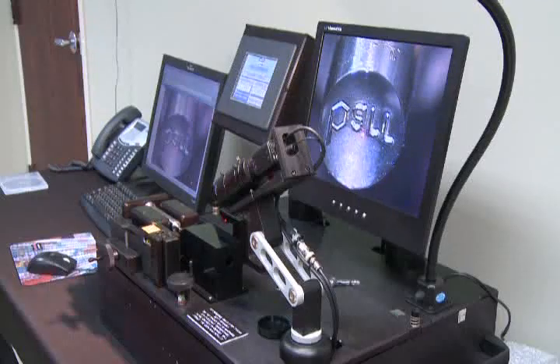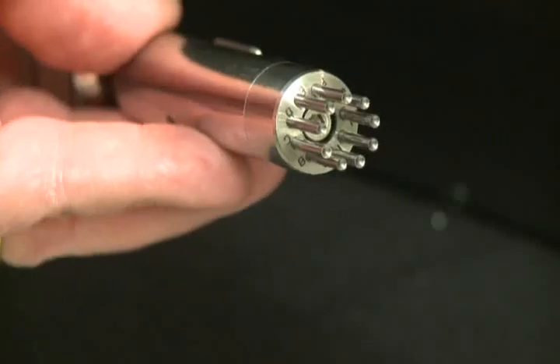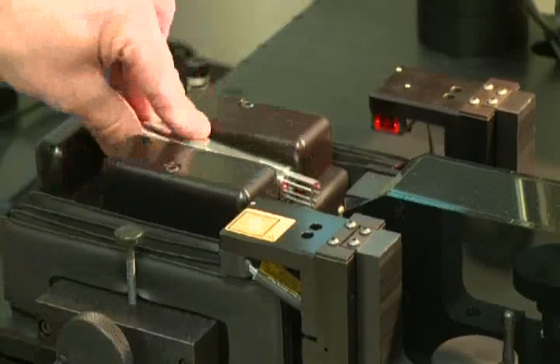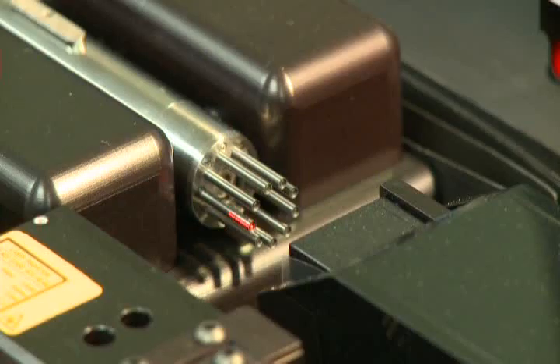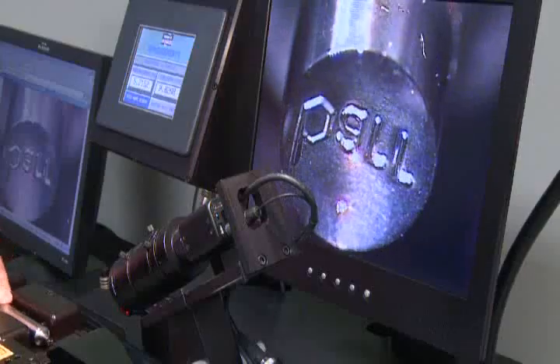In total, the TM2 system will streamline your inspections and increase efficiency and productivity. Your inspection process is going to be much more efficient, less time consuming, and more accurate. To learn more about the state-of-the-art TM2 system, contact Natoli Engineering to schedule a free trial. We do it via webinar — all the customer needs is access to the internet and we can have an interactive presentation.